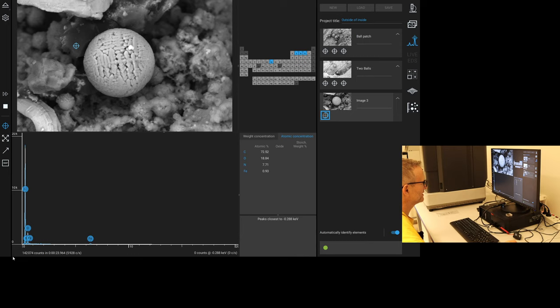Look at the carbon site, the peak. It's like everything. It might be that the other element traces here. Certainly the iron is just a reflection off here. Wow. And I imagine that if I fire my beam into here, this is going to be iron rich. Does concern me when I see this nickel and chrome in here, because it might imply that the magnetic forces of the exotic vacuum objects are adding to their magnetic core by ripping some of the steel out. Just something to consider.